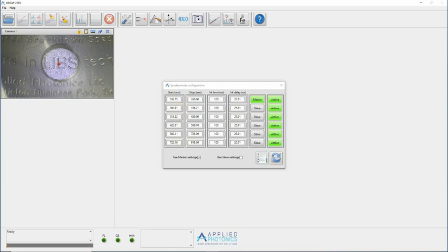Individual spectrometer channels can also be disabled if required. No data will then be acquired from the disabled channel. This is, however, generally unnecessary and potentially even undesirable. It should be noted that the master channel cannot be disabled.